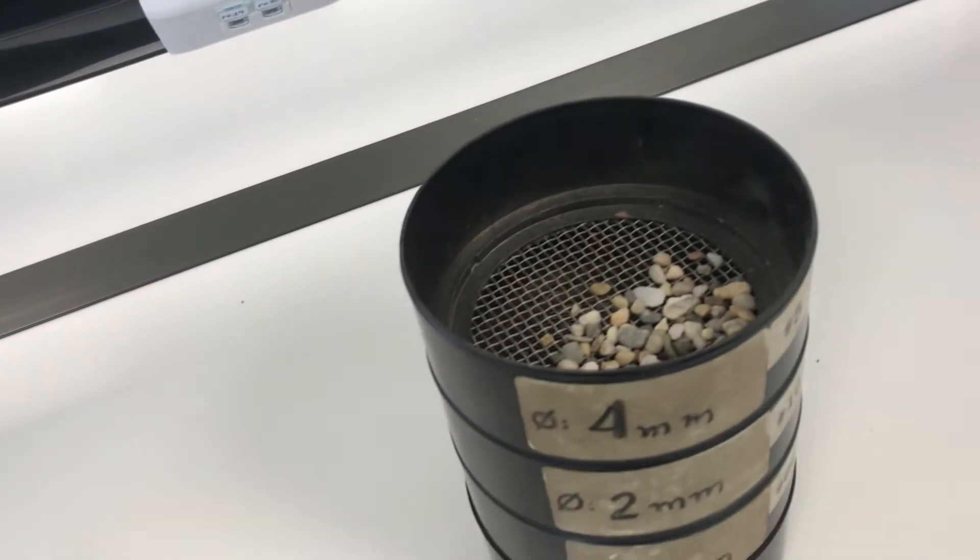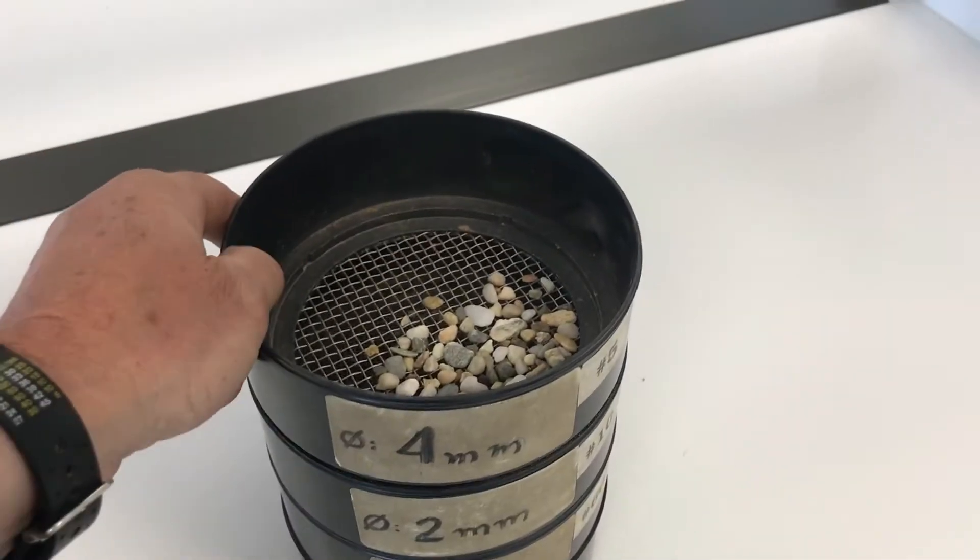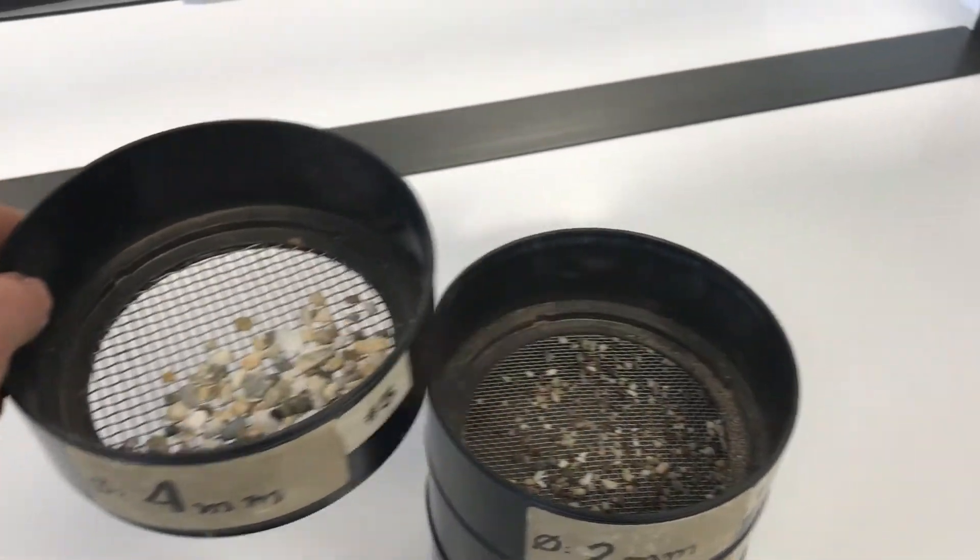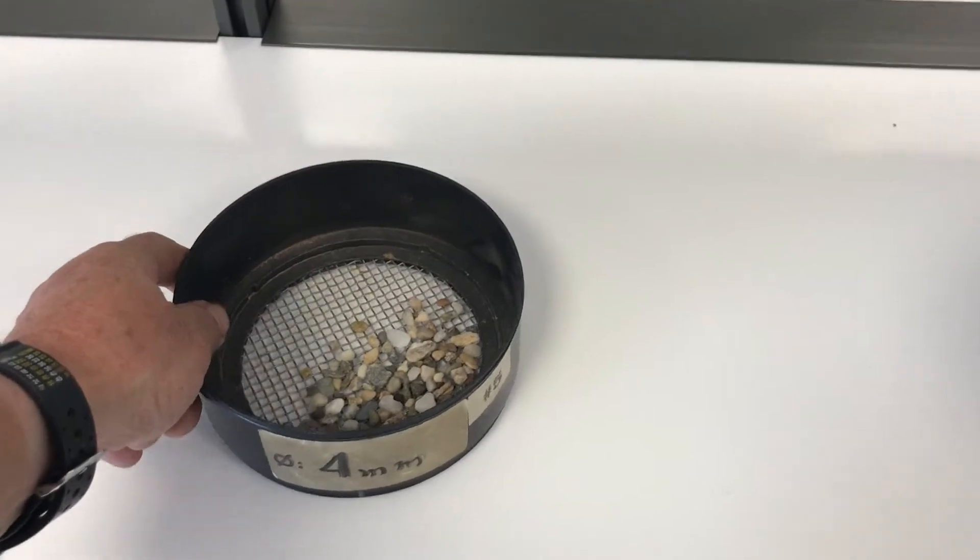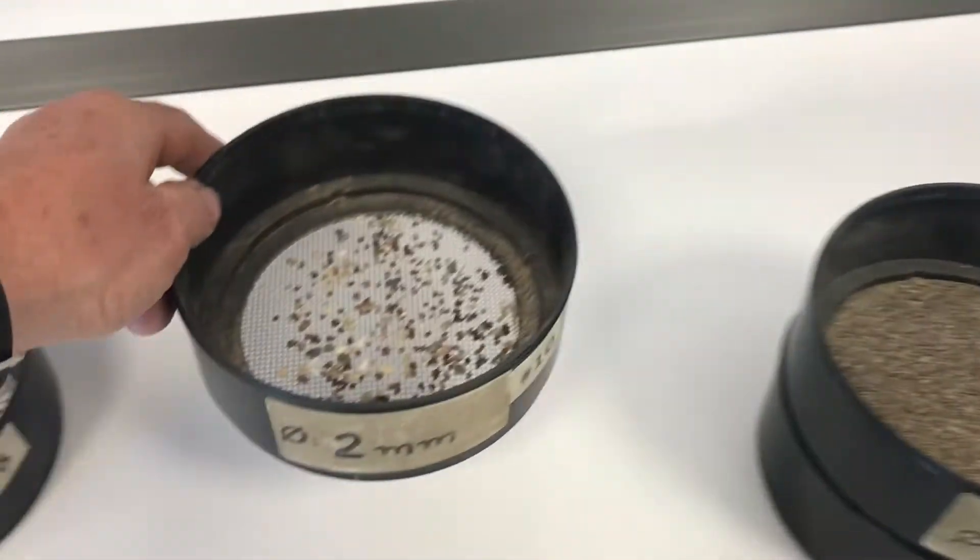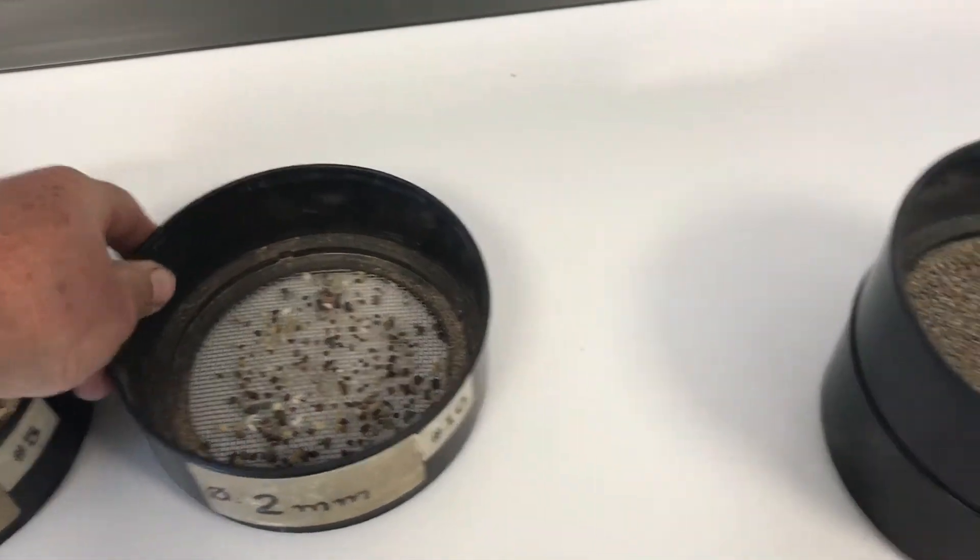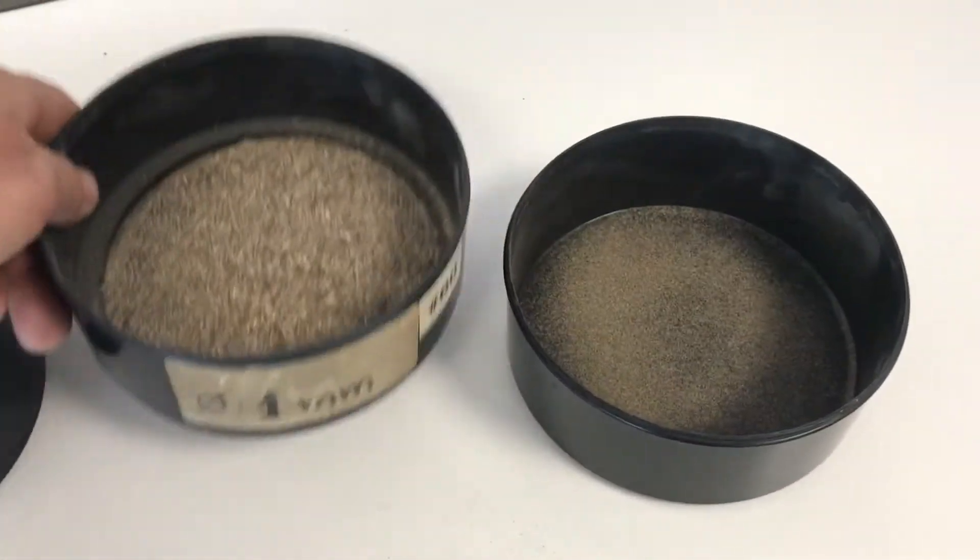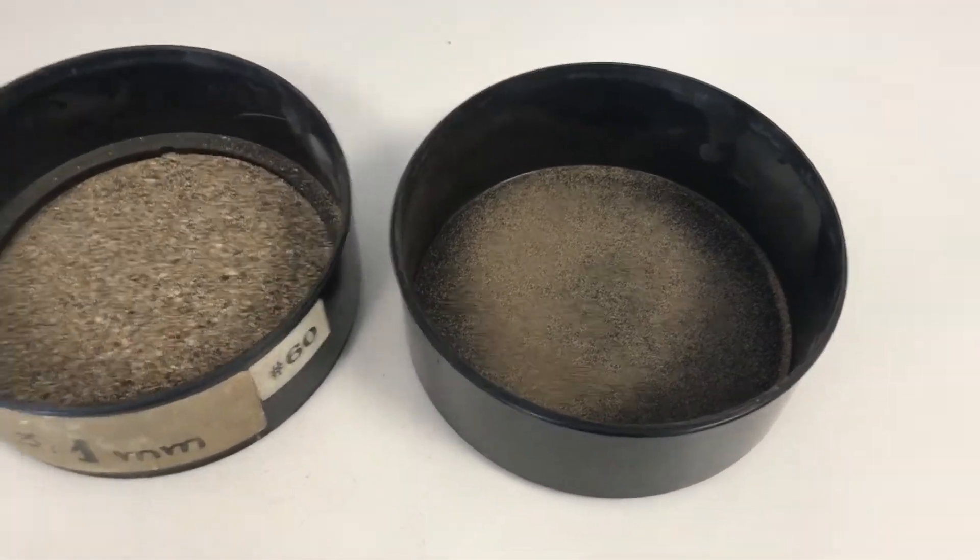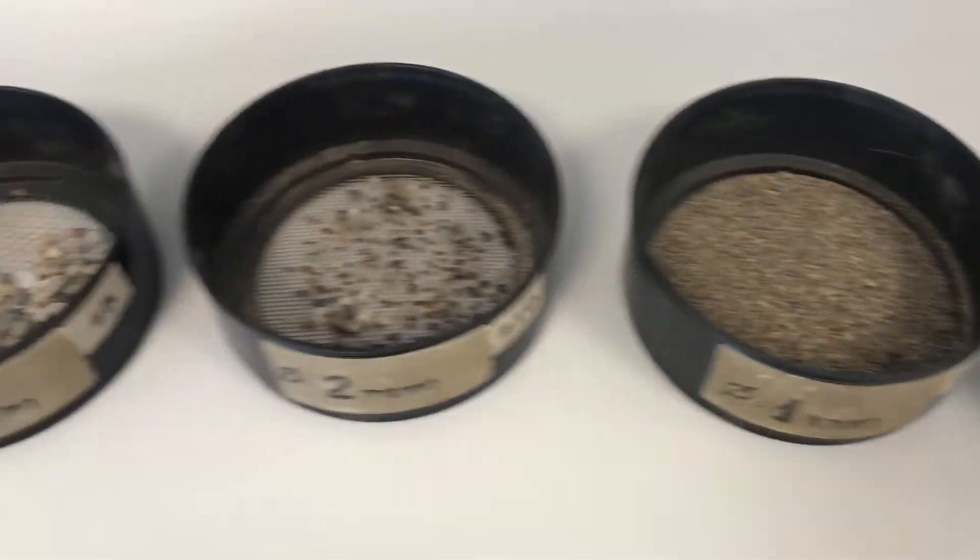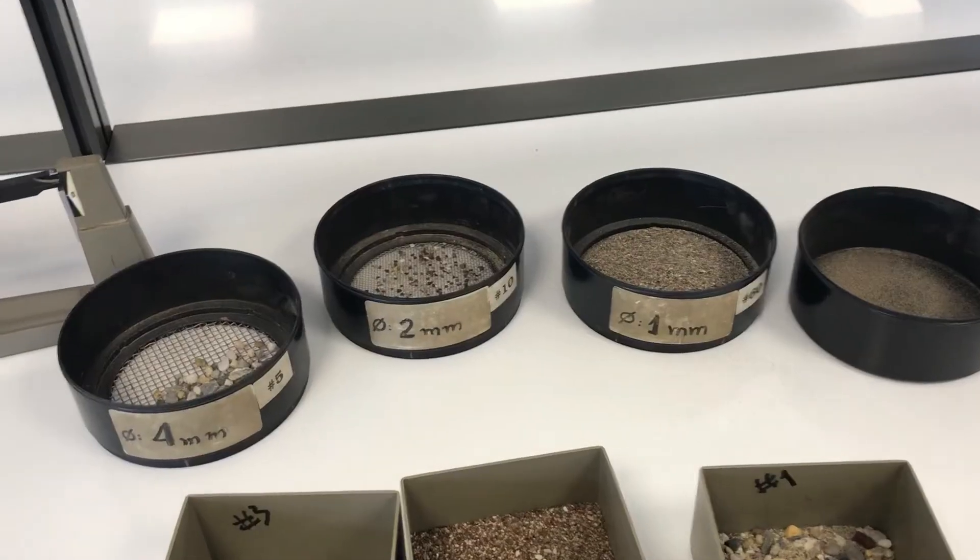So then we have the separation. So the first one, which is everything coarser than the four millimeters, and then the second, which is less than four but higher than two. Okay, one, and this is finer than one, so we've got four clusters.